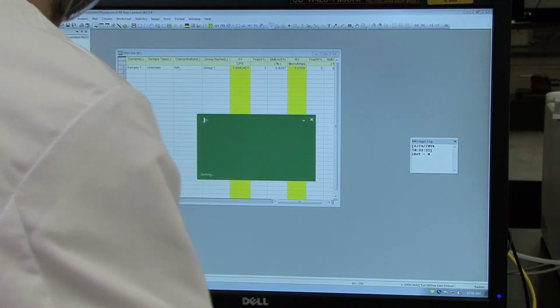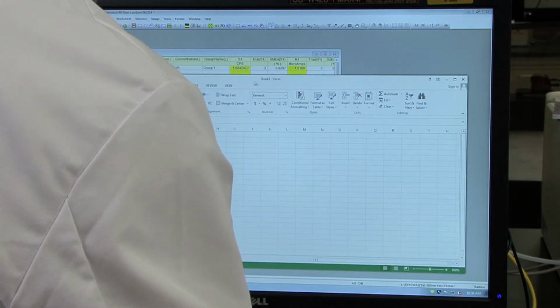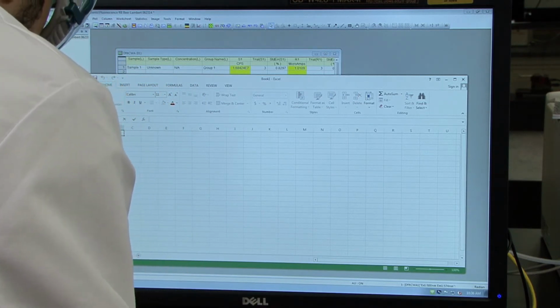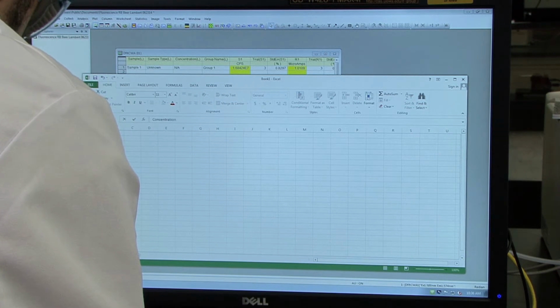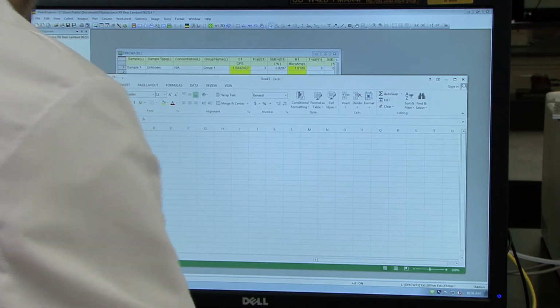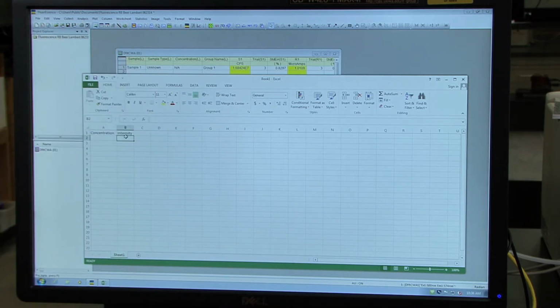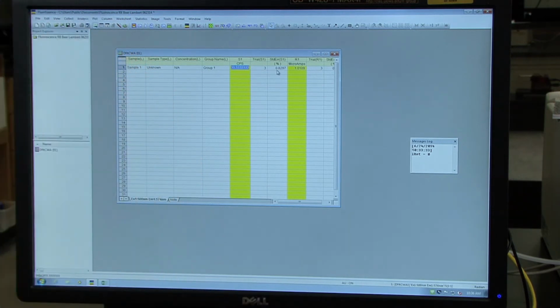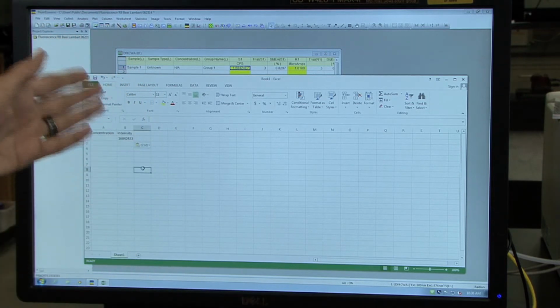The easiest way to make sure that this data is all kept track of is to enter it directly into Excel as you go. So you can open an Excel spreadsheet and have one column for your concentration of rhodamine B and another column for the fluorescence intensity that corresponds. And you can simply copy and paste, after highlighting, the fluorescence intensity in counts per second directly into the Excel file.